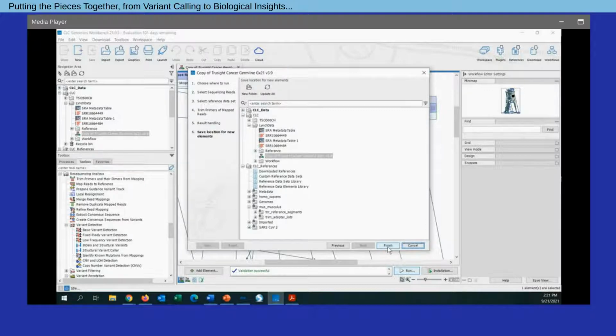These samples, a targeted panel, so smaller data, ran well under an hour. And again, if you have larger cohorts of samples or larger data overall, you can explore both our server-based options and our cloud engine-based options as well.